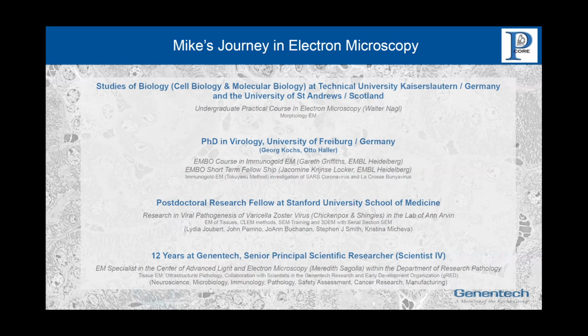At the same time, Joanne Buchanan, Stephen Smith, and Kristina Micheva developed fluorescence array tomography and conjugate array tomography, which helped me in developing methods for my studies of the pathogenesis of the varicella zoster virus.